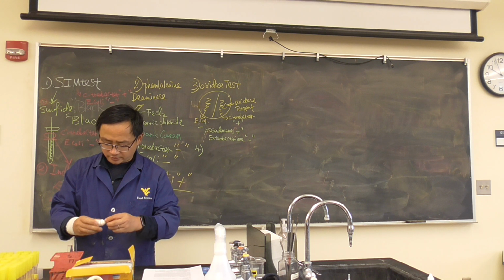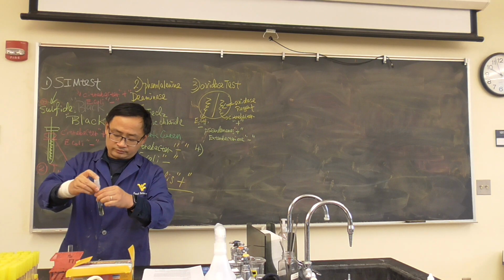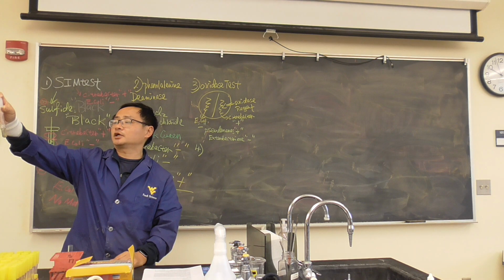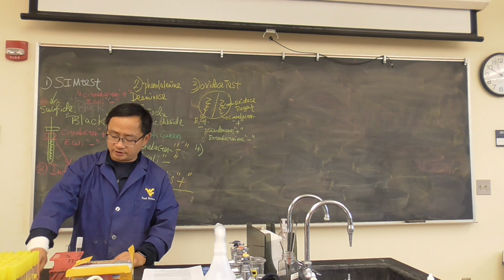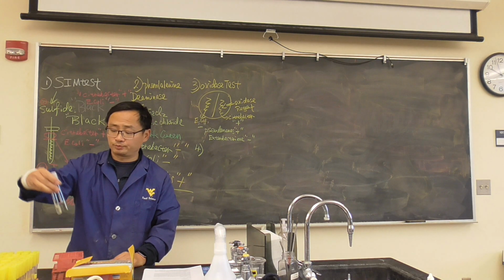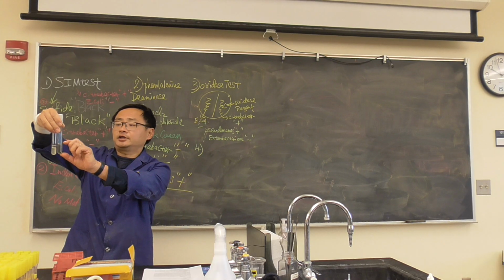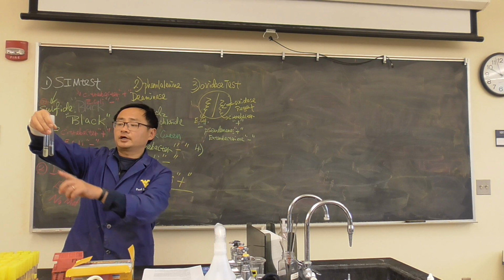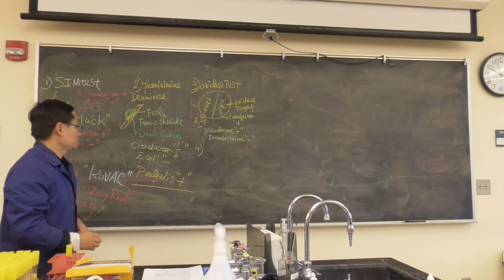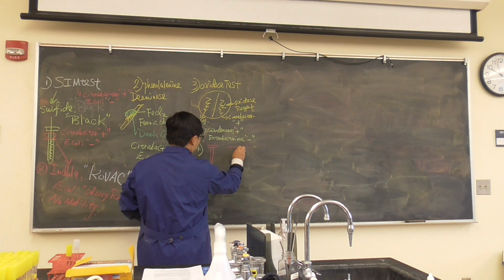Couple of drops of B. Oh, that's really bad. That ideally should be showing you red color after incubation, like 5 minutes. And this one you can add methyl red, it shouldn't be showing anything. Then showing you positive and negative. But that reagent is a little old. But ideally this should be red, and that should be colorless. So you can just write your ideal results here.